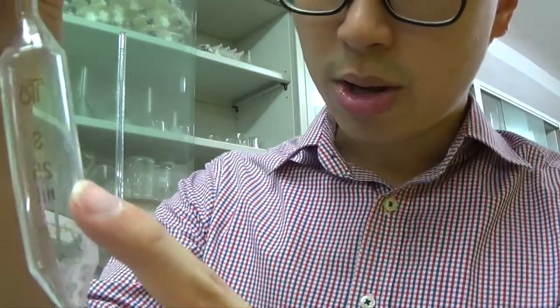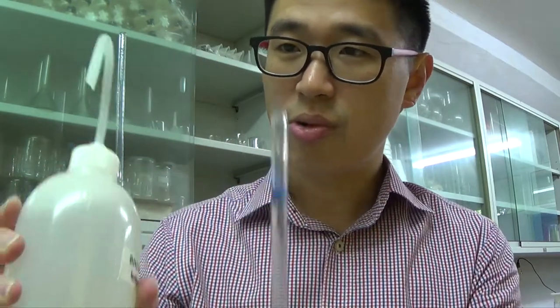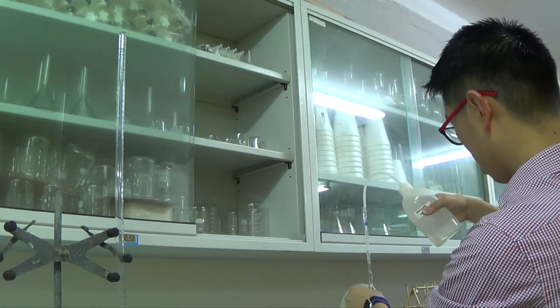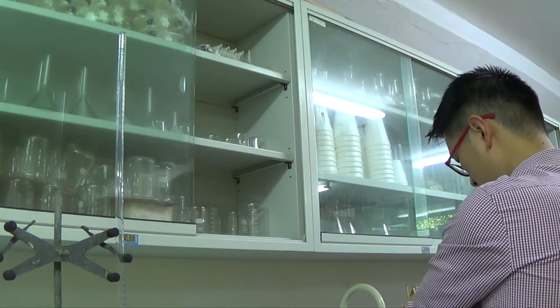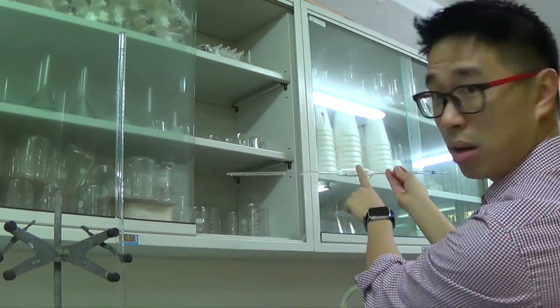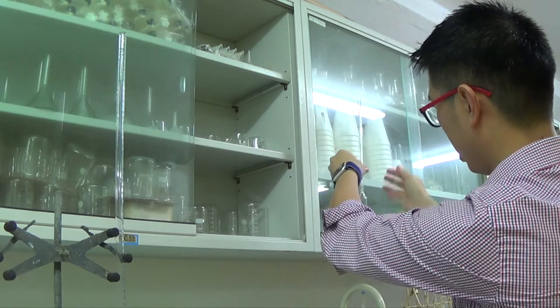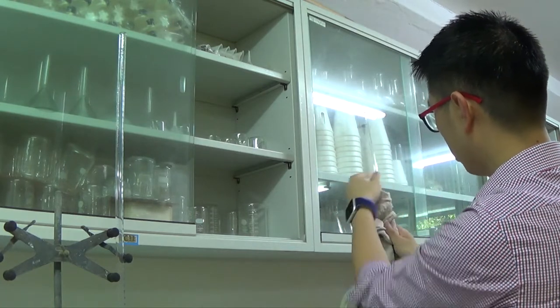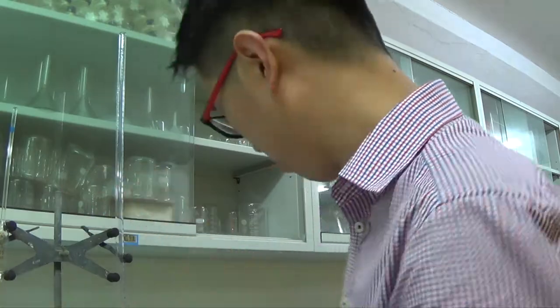Before we use it, you can see there's a bit of white stuff inside, so it's best if we wash it with a bit of distilled water. The wash bottle has an outlet that you can just push into the hole here. I'm going to do this at the sink so that I don't spill water everywhere. We want to wash the side of the pipette bulb, so we tip it a little bit, roll it, and then let out as much of the distilled water as possible. Wipe the outside dry, and then just leave it standing there before it's ready for use.